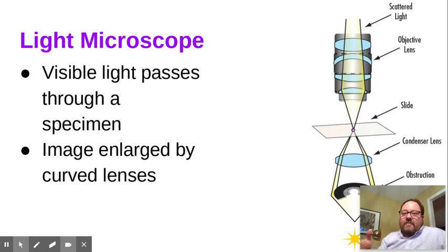How do we identify what we can see? And one common tool is a light microscope. This is the kind of microscope we use in class. What will happen is you pass light from a light source through your specimen, and then you bend that light using objectives or curved glass, and then you're able to see an enlarged image of that structure.